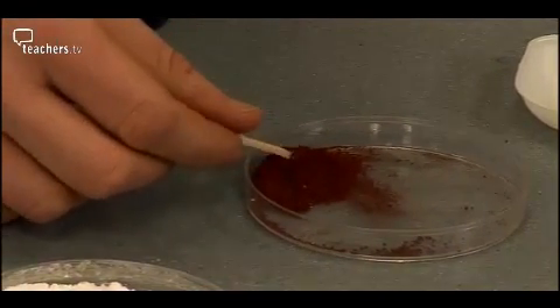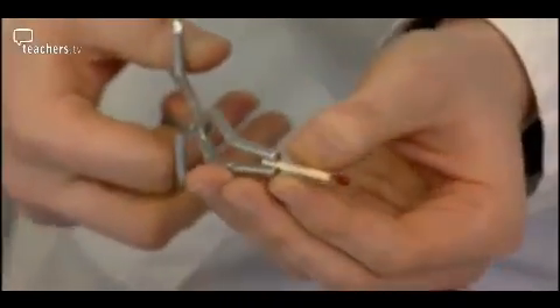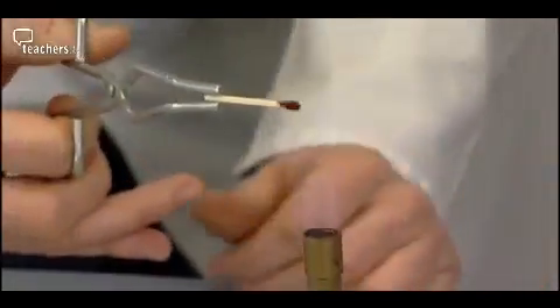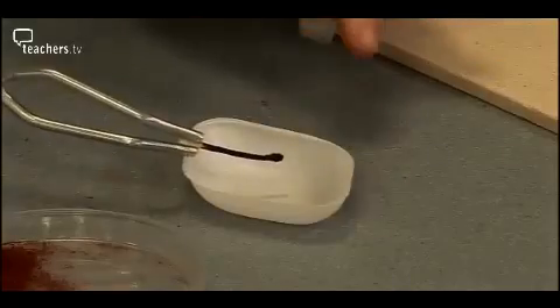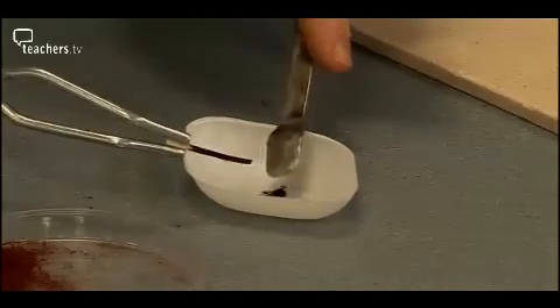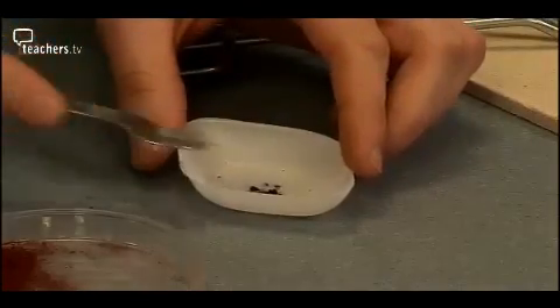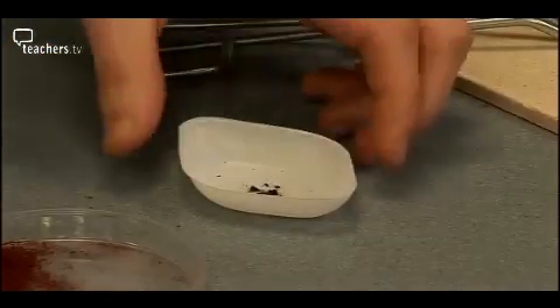Using tongs makes it a bit easier to hold the match because sometimes it can burn right to the end. We're going to put it onto a hot flame until it starts to go quite black, then pull it out and give it a gentle blow. Now we're going to crush this in a plastic weighing boat, give it a little crush, take that off. Now hopefully we should have some moving magnetic particles.